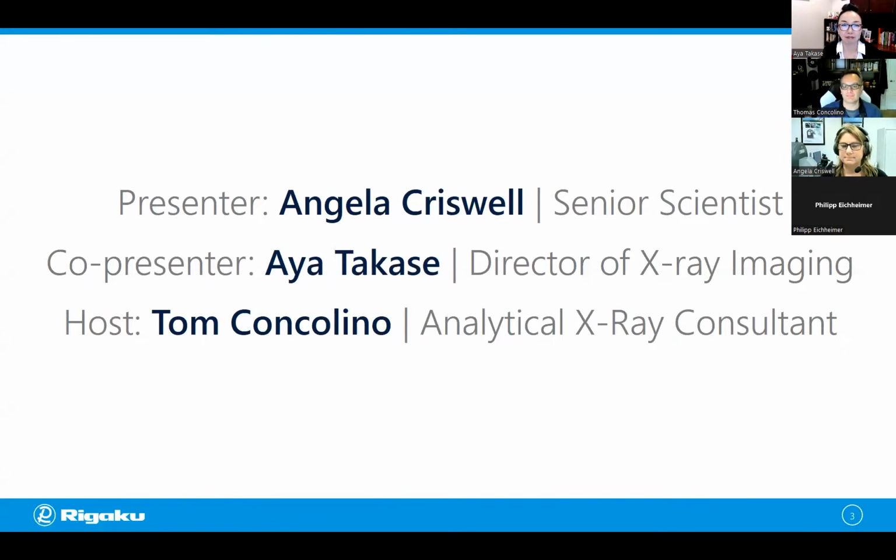Hi, everyone. Thank you for attending Rigaku's workshop series on X-ray computed tomography for materials and life science. This workshop will be the first in our deep dive series covering filtration analysis, and will cover CT data collection specifically. This session will be taking place in the lab, with Angela and I reviewing in real time how to develop a scan for filtration media. They'll offer their thoughts on dealing with unique challenges of performing CT experiments on filtration samples.